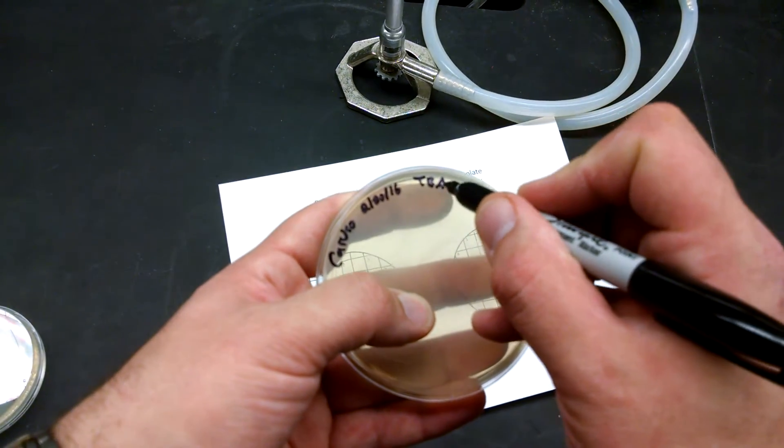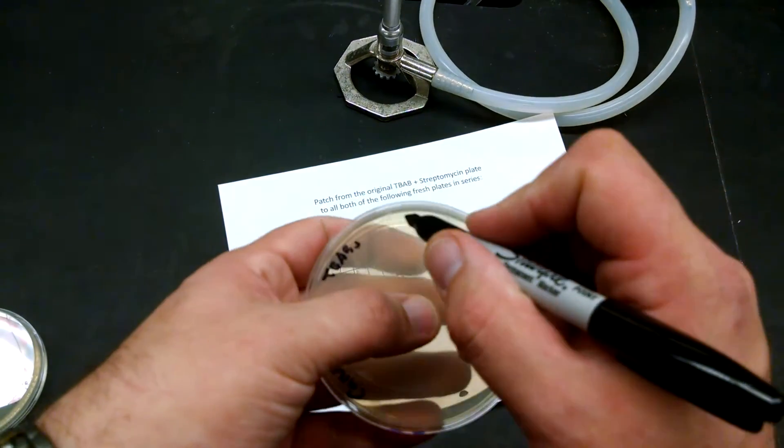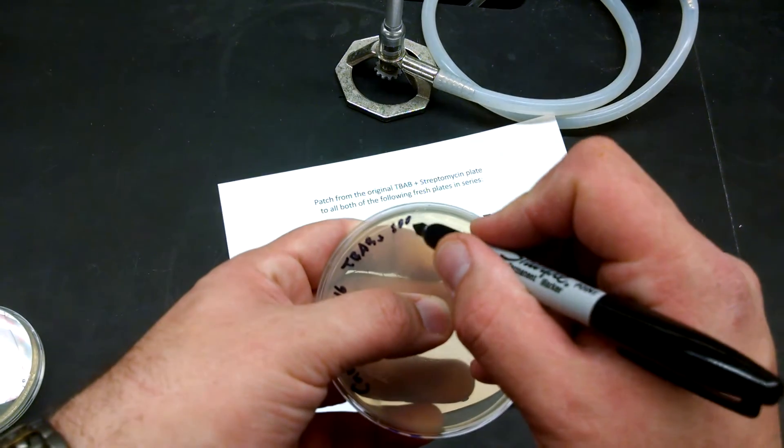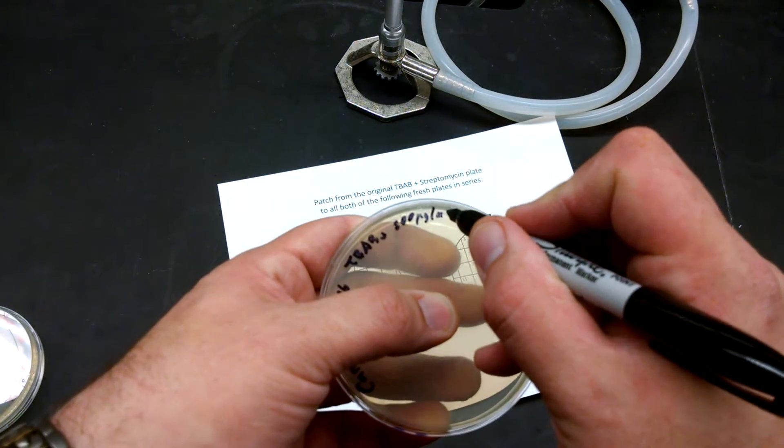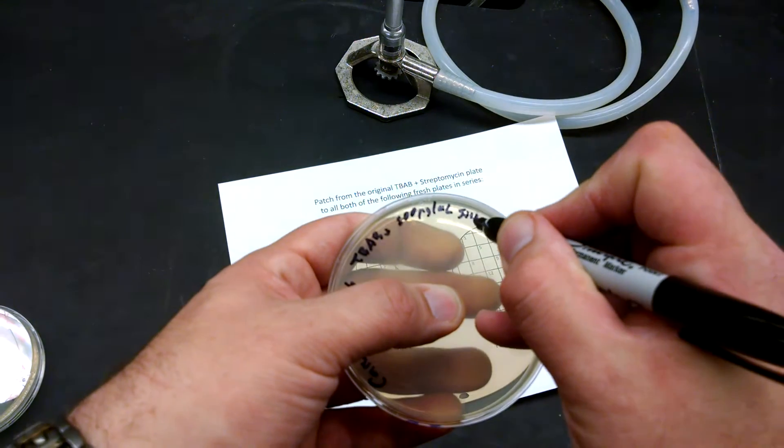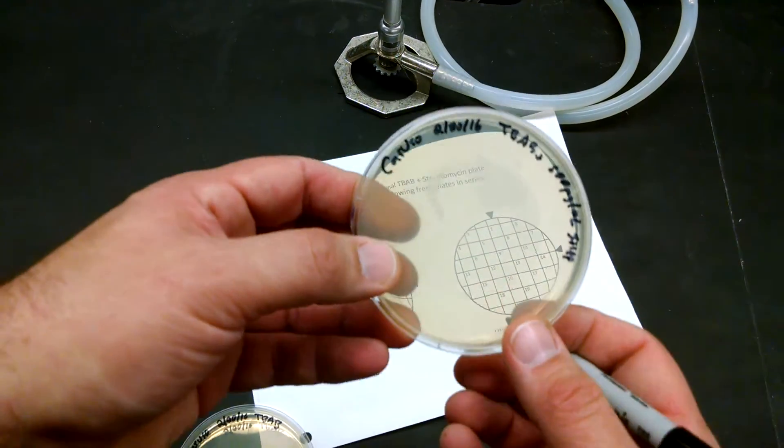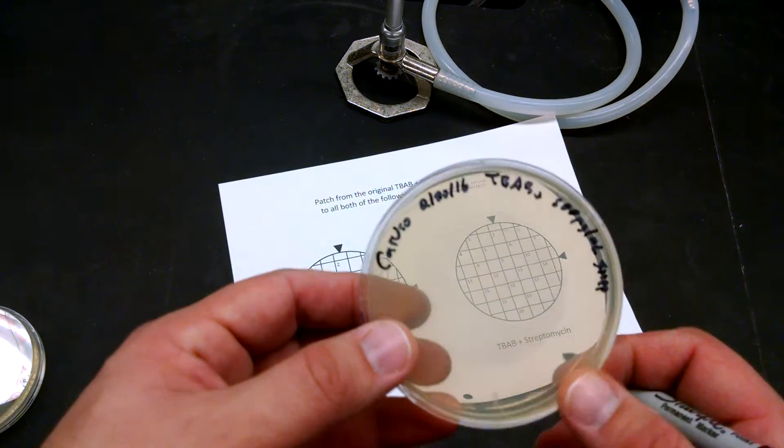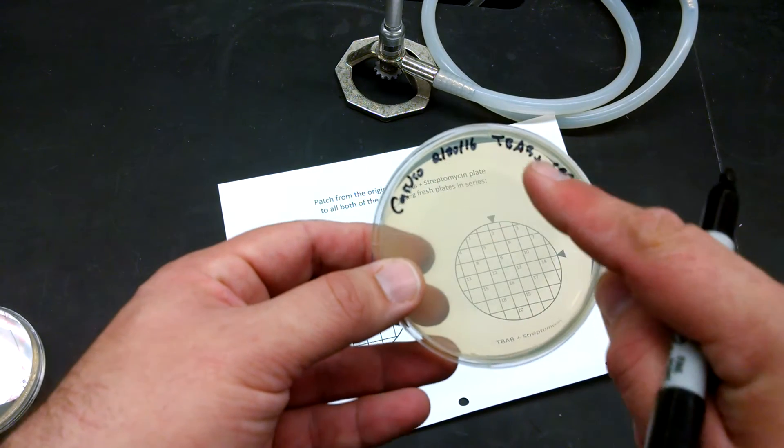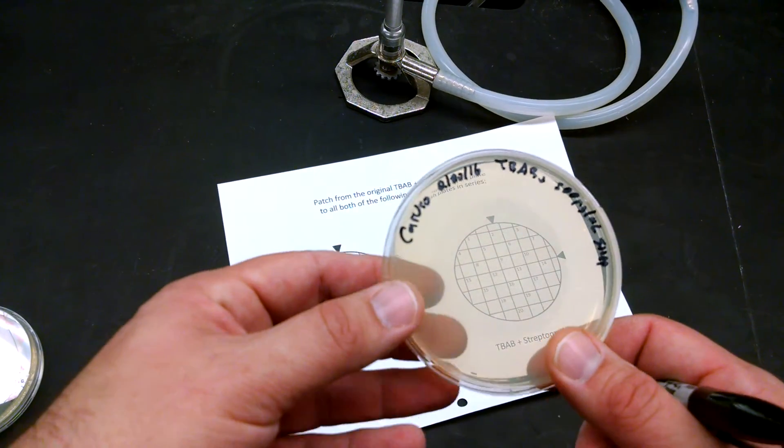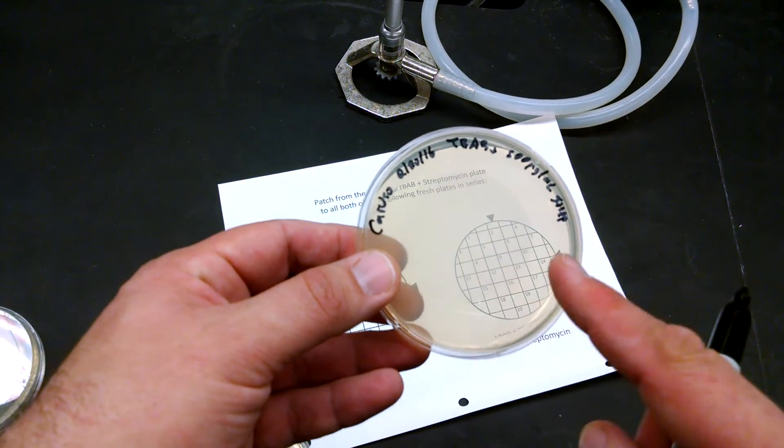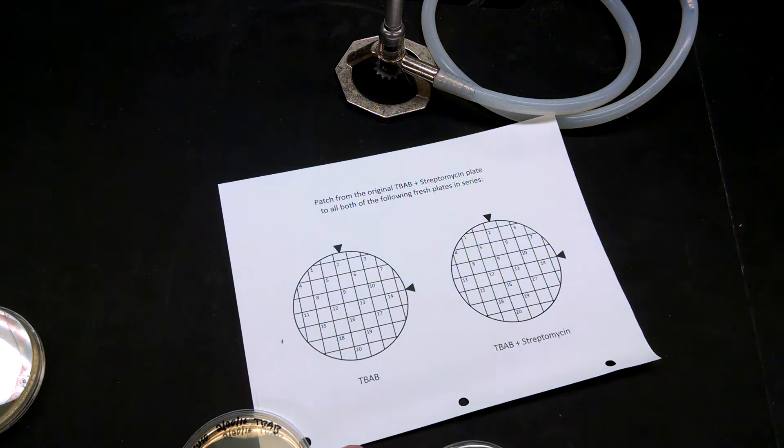And this one is TBAB plus, in this case it's 500 micrograms per mil strep. If your concentration is different or if you're looking at something else, you should label it whatever it is. Make sure you label around the perimeter. Don't label in the middle or else you won't be able to see what you're trying to identify.